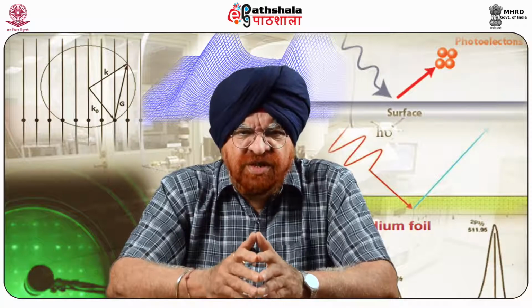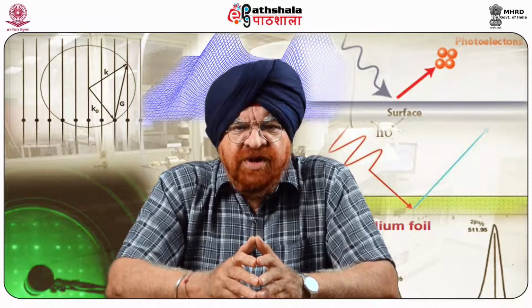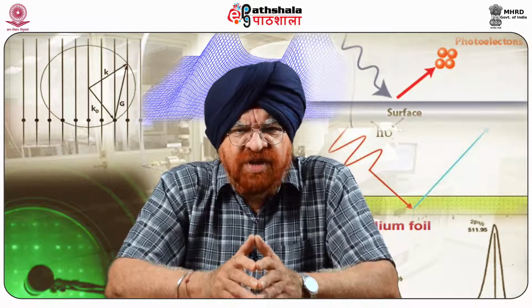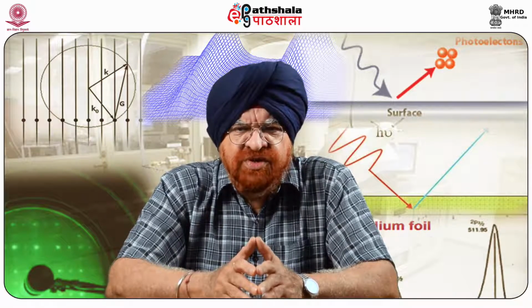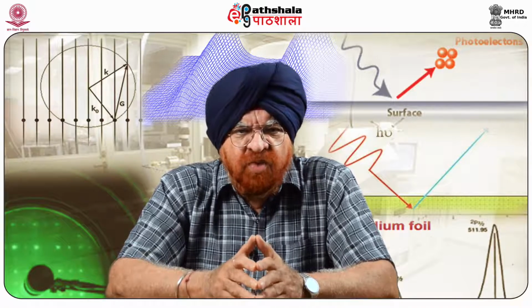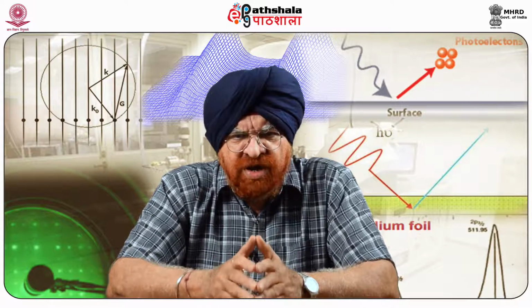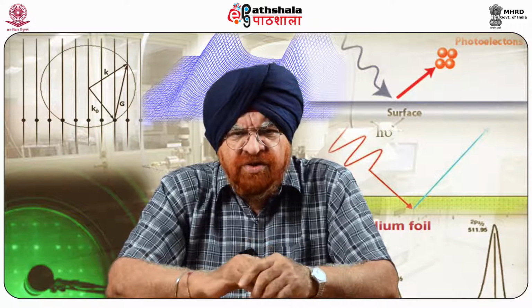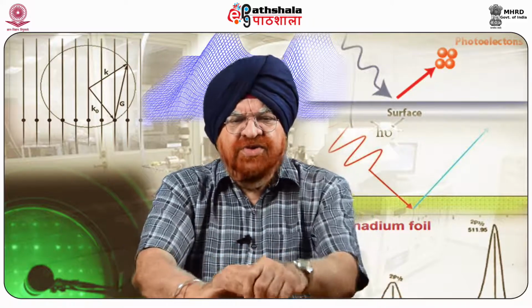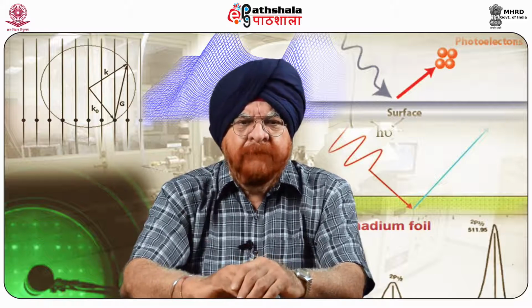That means it has a very high resolving power. It directly visualizes electrochemical processes in situ and in real space at molecular or atomic levels, as I said. And to reach that level, this is a great piece of equipment which is able to help us in very many situations.